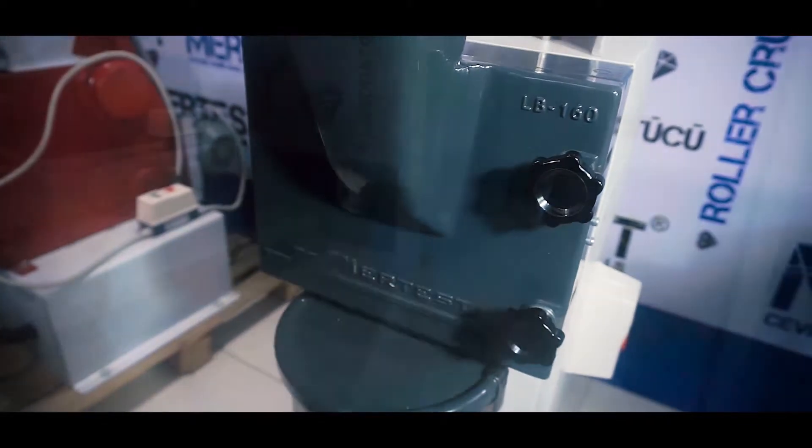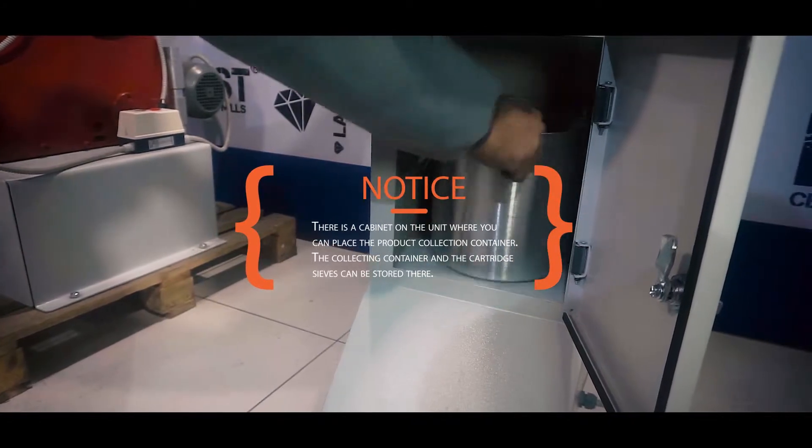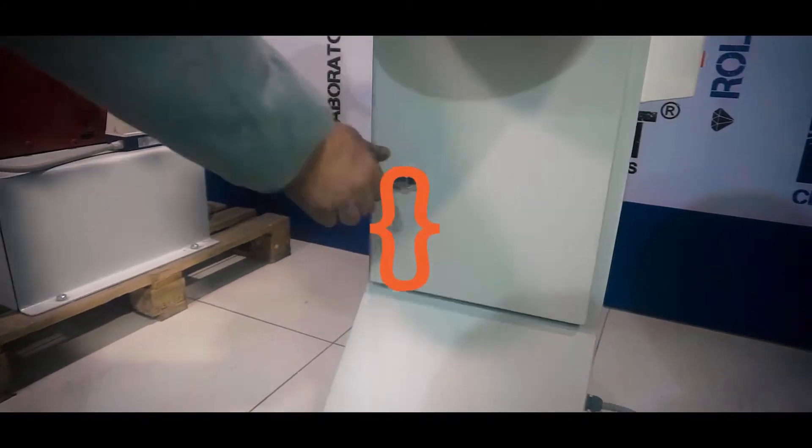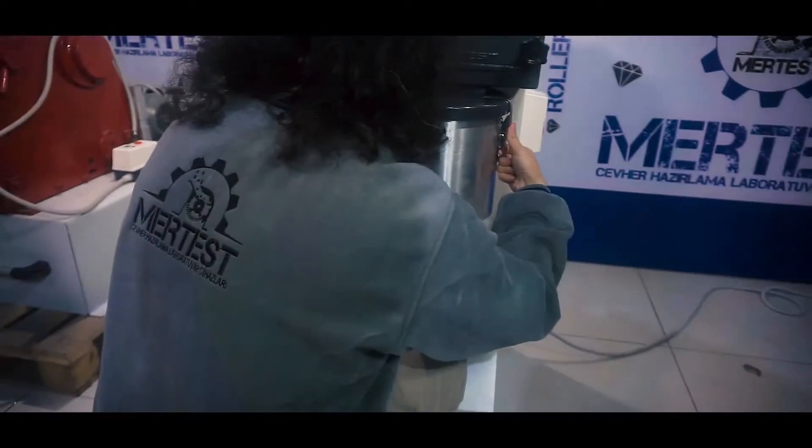There is a cabinet on the unit where you can place the product collection container. The collecting container and the cartridge sieves can be stored there. The LB160 mill has an 8-litre product collection container.